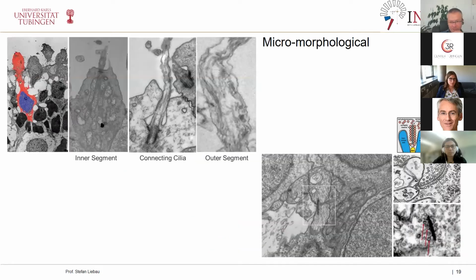That's what I said. On ultrastructure level, we also looked at parts of the outside of the photoreceptor. So you can see that they at least construct also inner segments, connecting to the outer segments. Of course, if you look at these pictures here, you would say, well, it doesn't really look like a human retina, and you're absolutely right.